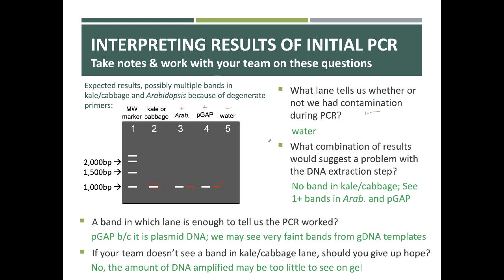Now, in this particular lab, we're amplifying DNA from raw tissue. Well, not raw tissue, but from tissue that's been ground up. So while we expect to see a band here, it's possible it's not going to be very dense. It's possible that we won't see it, but it's still there. And so what we've done in the past in this lab is, even if a team had no sample here, we pretend like there is still sample there, and they proceed to the next step with the nested PCR. And after that, they find out that they really did have product there. And I'll explain that in just a moment when we talk about nested PCR. But never give up hope. But it's okay to get frustrated.